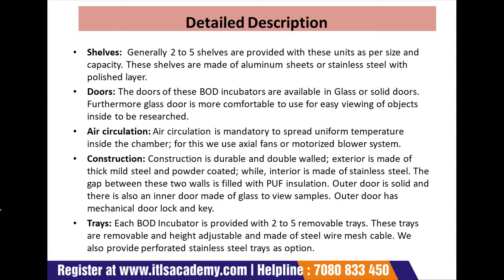Next we will discuss the slabs. Each biochemical oxygen demand incubator is delivered with a number of slabs to keep the objects in the units. The number of these slabs is provided with these units as per size and capacity. These slabs are made of aluminum sheet or stainless steel with a polished layer.